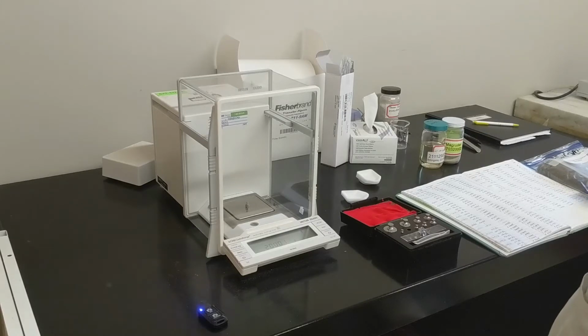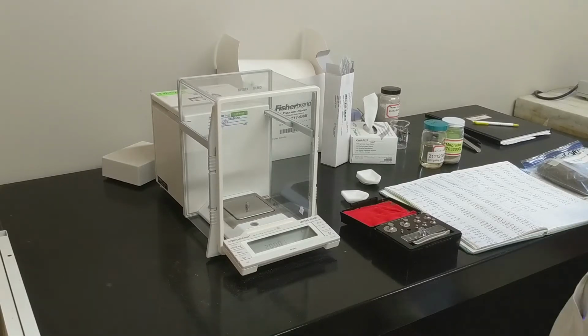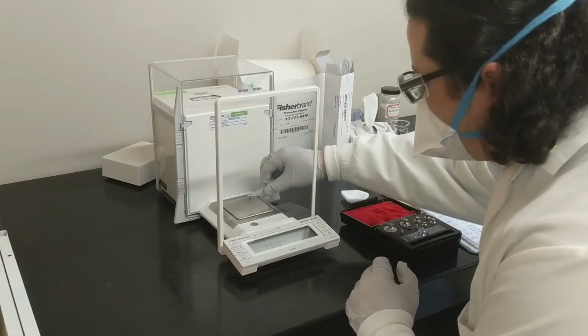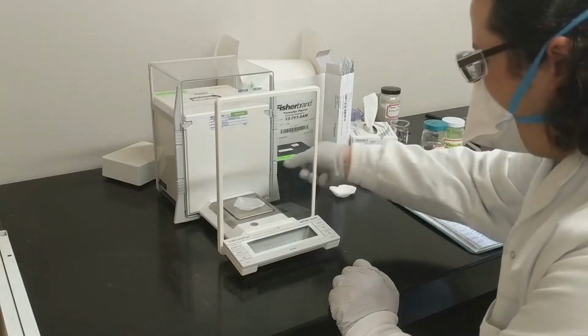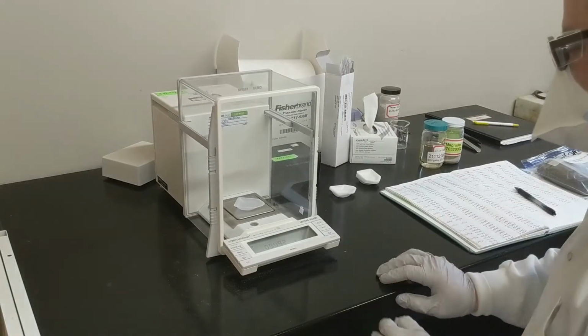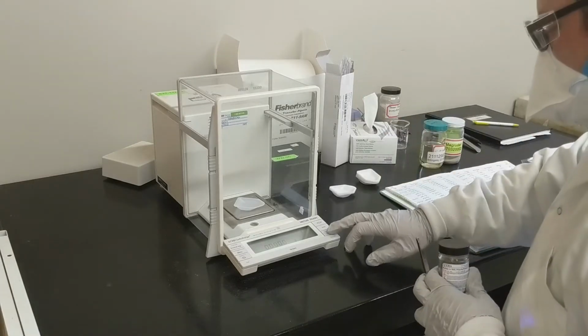So to start, we're going to be weighing out our solid samples on the balance, and before we do any weighing of our sample, we actually have to verify our balance. So you can see, using our standard weights to make sure that our balance is still measuring where it should be. Generally, you want to sort of flank your measurements with what you're expecting, so I will be weighing out about 1 gram in this video, and so I'm using the weights for the 1 gram and the 2 gram.